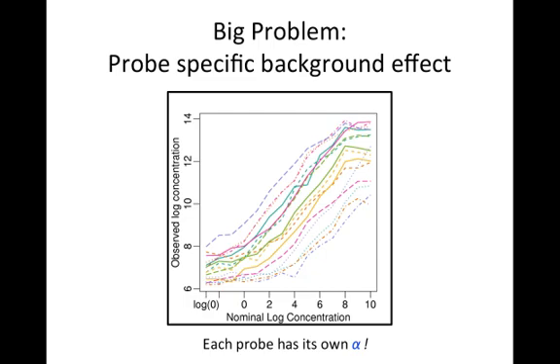That plot I just showed was the average across all arrays, all genes. If I make the same plot, but for each gene individually, actually this is not even each gene, this is each probe within a gene. So I take one gene and I show all the probes for that probe set. This is an older chip, so it's 16. You see this flat at the beginning and then line behavior for every probe, right? So it's flat because of background and then straight.